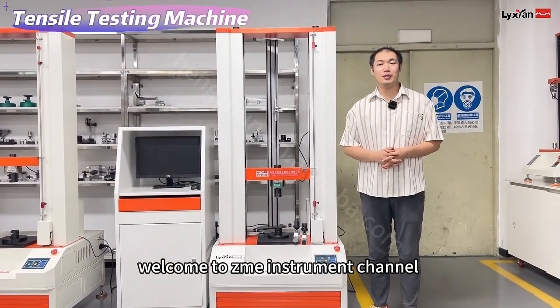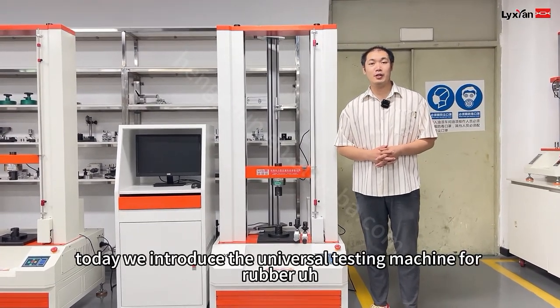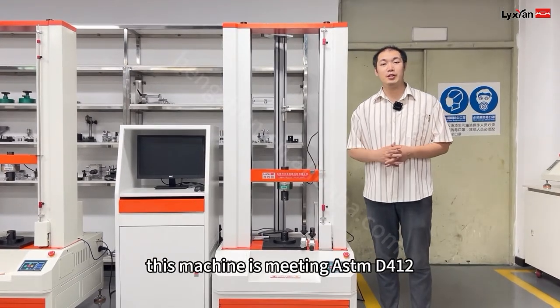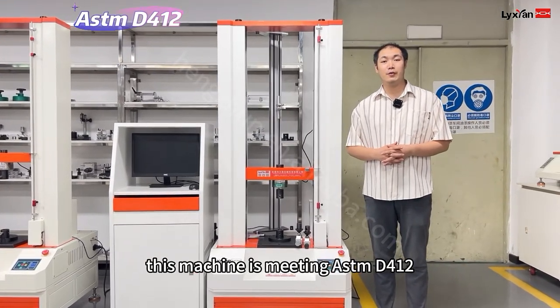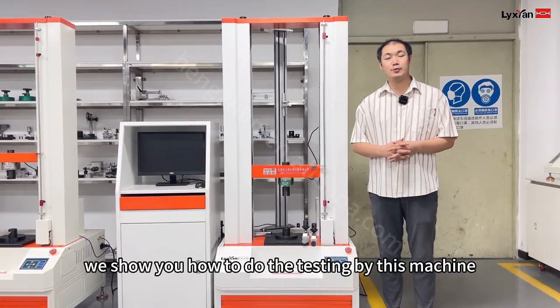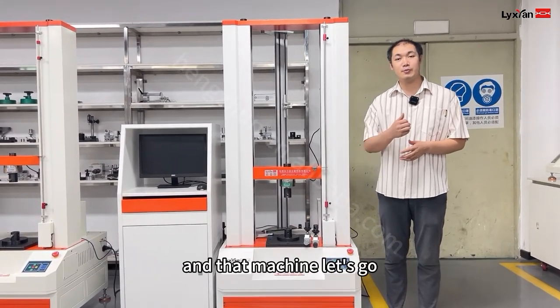Hello everyone, welcome to Nixian Instruments channel. Today we introduce the universal testing machine for rubber. This machine is built to ASTM D412 and ISO 37. Today we show you how to do the testing using this machine and the cutting machine.